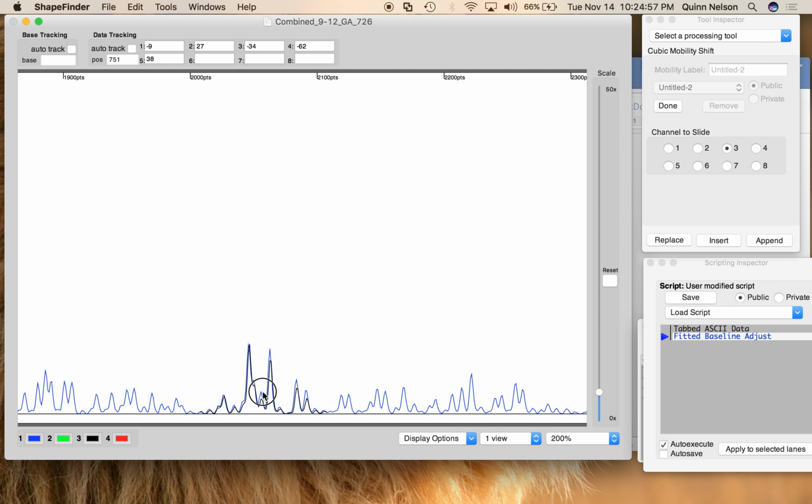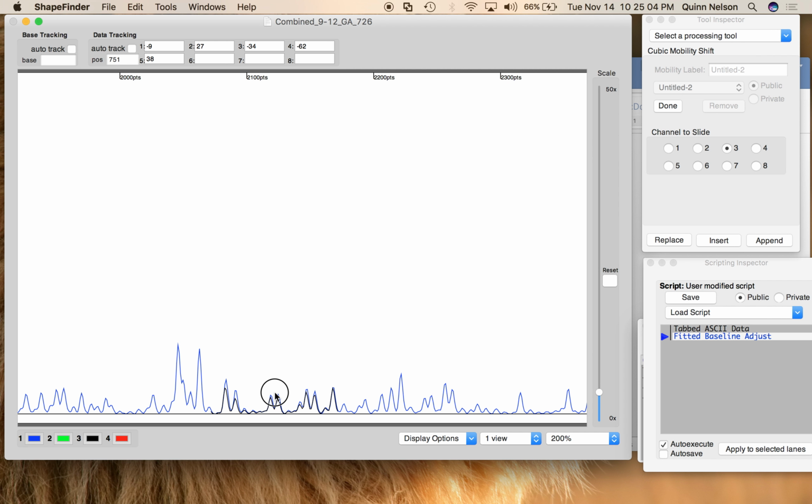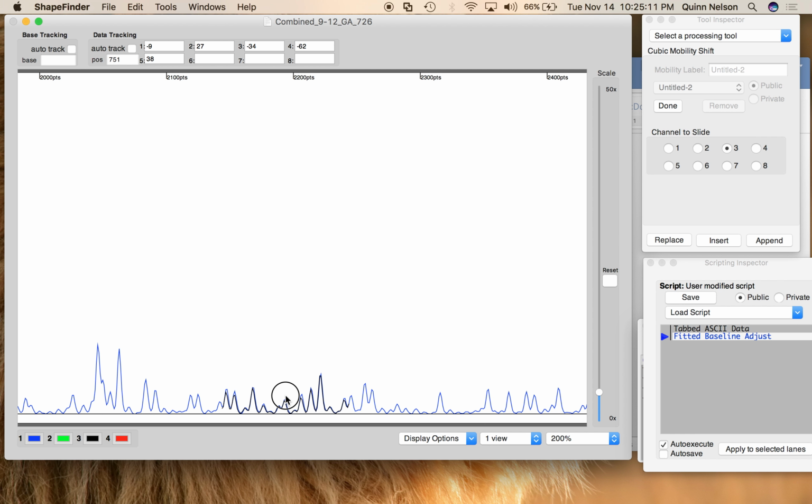So these peaks just got bigger, making it easier for us to notice patterns. And we can keep doing our job all the way through. We're at 2100 data points right now. That's perfectly fine, the progress that's going on.